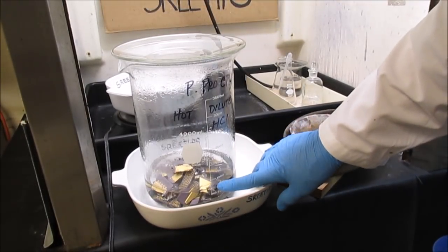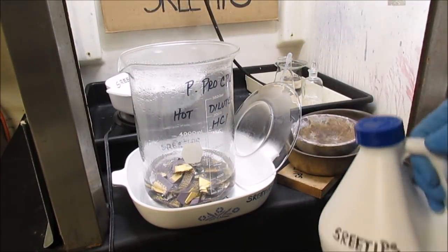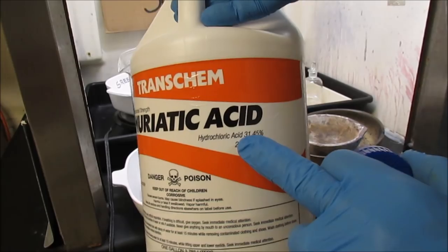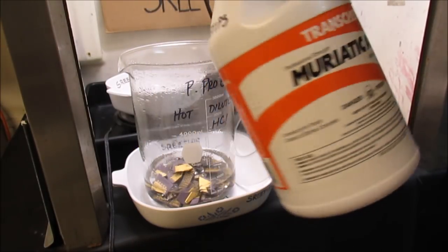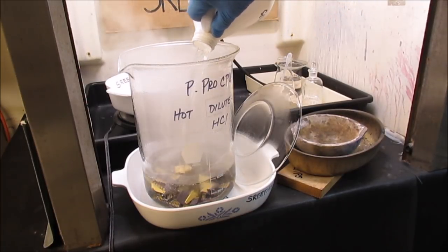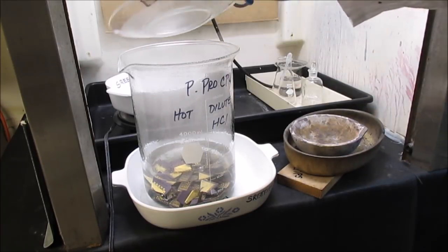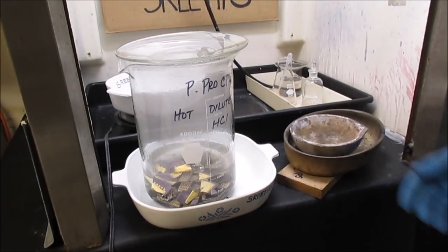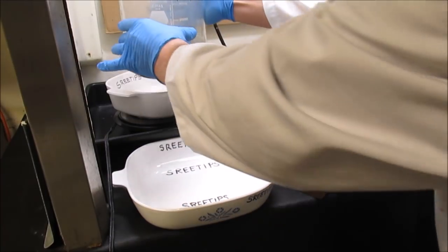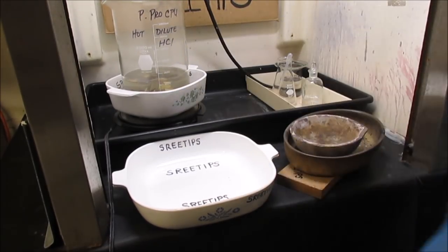I started out with 600 ml of tap water in this beaker, and so what I'm going to do now is add about 600 ml or so of concentrated muriatic acid, 31.45% hydrochloric acid. I'm going to pour it right on in. I'm going to give it a quick swirl here to get it all mixed up real good. Set it on the heat, put it on about medium heat and just let that cook for a while.